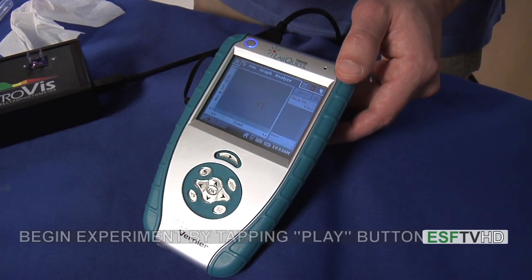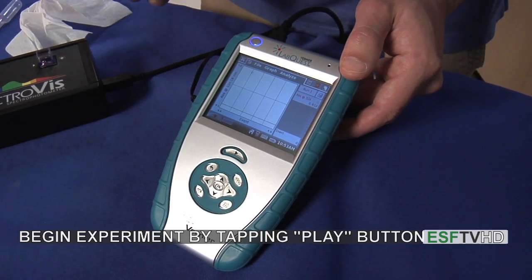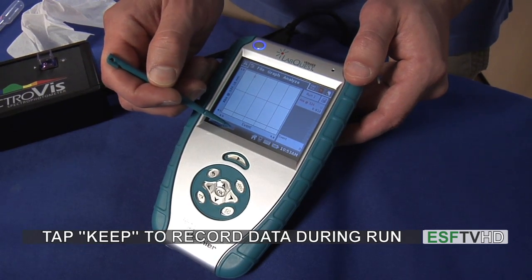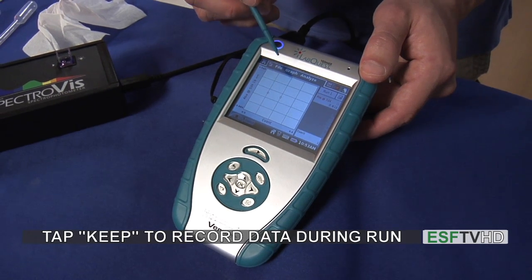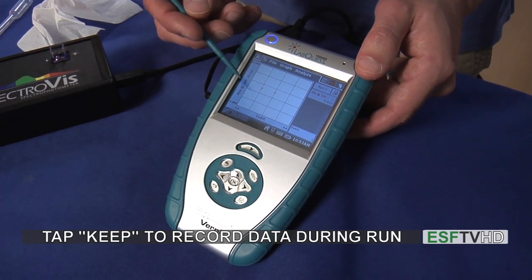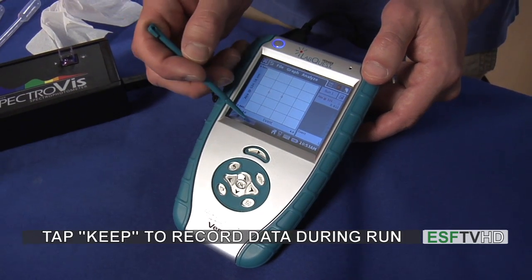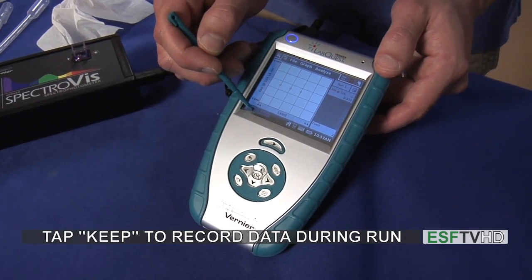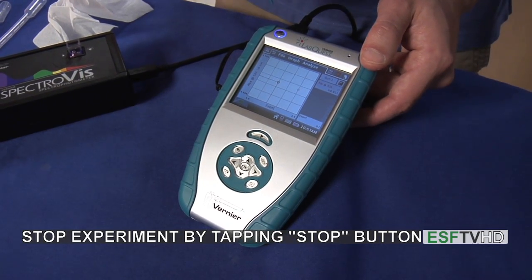If I want to begin an experiment, I would hit the play button and we see the absorbance with that little red dot. I can click keep at the bottom, and it will keep that one point. Maybe I'm doing a kinetics run or some other experiment where I'm changing a concentration — I would have another point and hit keep again, and so on, until we stop the experiment by clicking the stop button. Then we have our points right there.